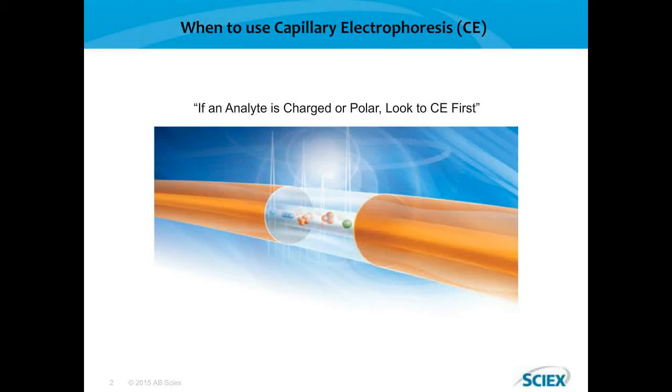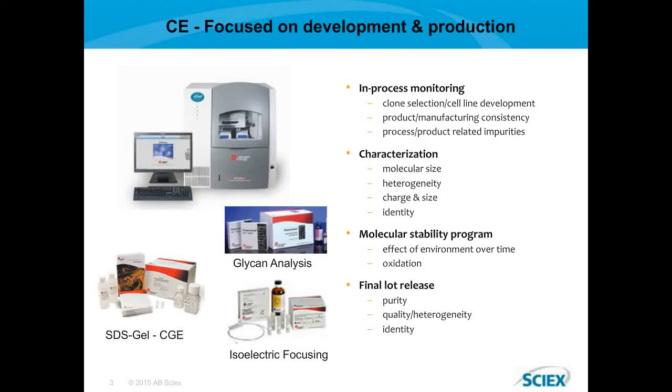CE has made the analysis of polar drugs and their metabolites no longer much of a challenge to toxicologists, and it's an ideal fit with electrospray ionization mass spec. Since that time, CE has made its way into a demanding regulatory environment of biopharma and quality assurance, quality control. Its use speaks volumes about the technique and its dedicated scientists who are using it to deal with analytical challenges ranging from the routine to the exotic.